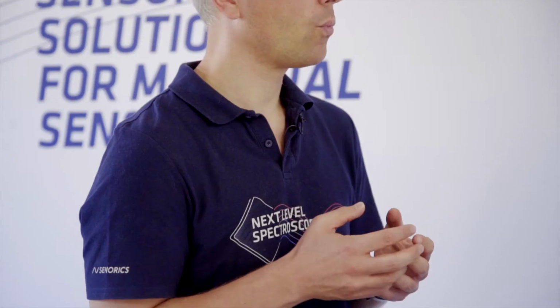Okay. So let's get back to the question about applications. If I want to do material sensing, what kind of world is open to me? What kind of applications can I actually do? And is this rather limited or is this rather broad? This is rather broad, and you need to find the right place to pick in because you can do many things. For example, you can measure what this shirt is composed of because there's a molecular structure behind it.